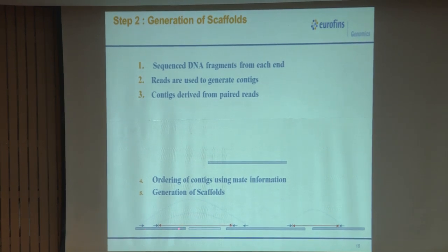But where did I get the clue of this region, how do I know this contig is after this contig? No, I do not have an overlap. I have insert information, right. So, based on this I can identify this sequence is after this, because the read of my R1 and read of R2 is going to the other contig. So, I know this is against this, but what is there in between I do not know. To cover that in between part I need an overlap, but to know this is after this, my insert sequence will be telling me.